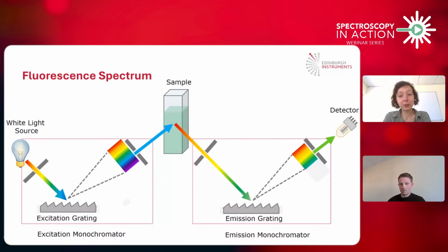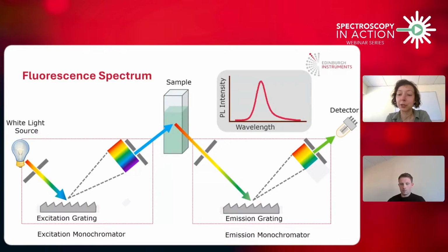So now we have the absorption spectrum of the quantum dots. We want to characterize their emission spectrum. This measurement is going to employ, again, the xenon lamp. In this case, we're going to fix the excitation monochromator at one wavelength, which, as Tommy said, is going to be between 450 and 500 nanometers. Then we scan the emission monochromator to record the intensity at each wavelength of emission. This is going to generate a fluorescence spectrum, as shown here, intensity against wavelength.